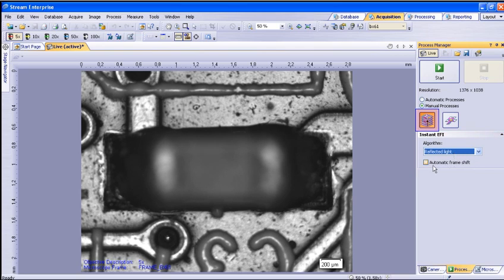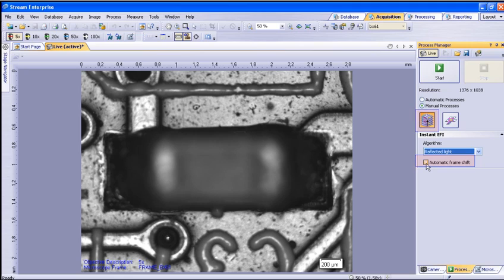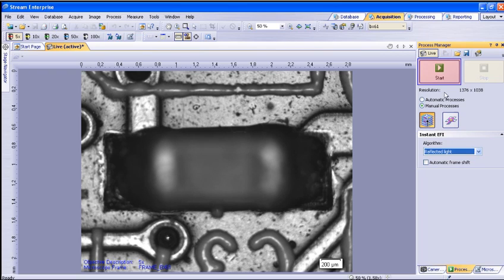The Stream software has the capability to correct for any frame shift that will occur from a standard stereo microscope due to off-axis image capture. Simply checkmark the automatic frame shift to allow the software to align these frames during capture. Once you have the settings in place for the type of image capture you will be performing, you simply select the Start button.